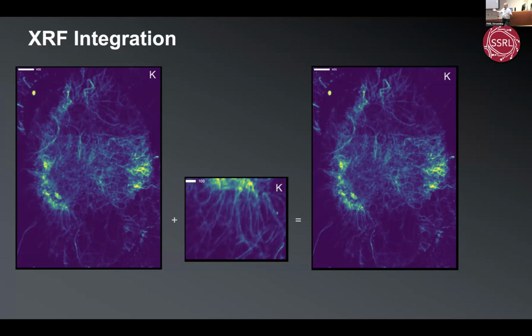We'll walk through this example tomorrow too. But imagine if this was chemical information data. You have a large context data file from one beamline, and you want to show your really cool high resolution chemical information. We can put that in the same image so that your publications look pretty and nice, and not just trying to align it later on.